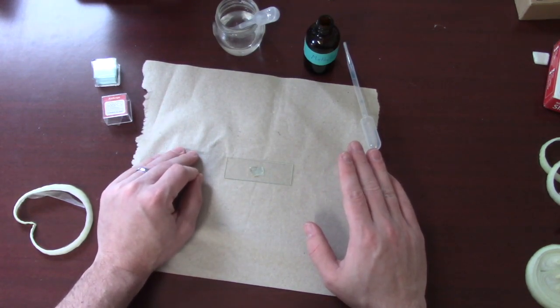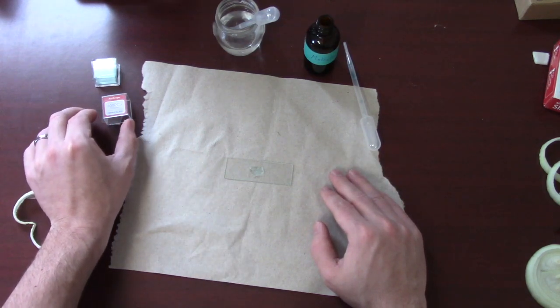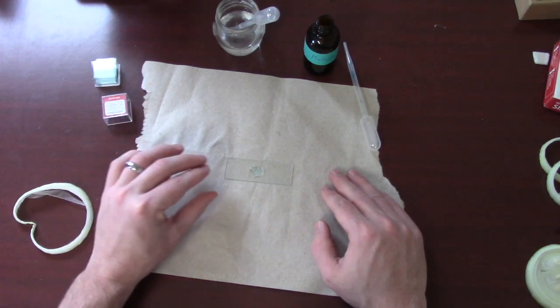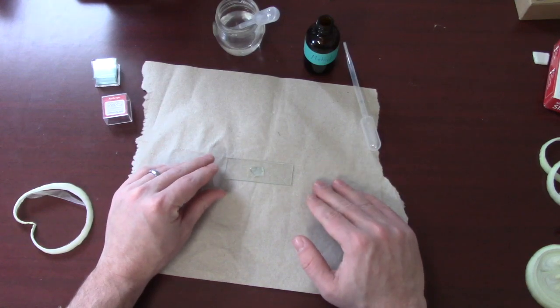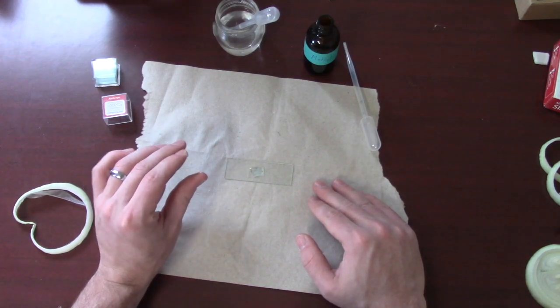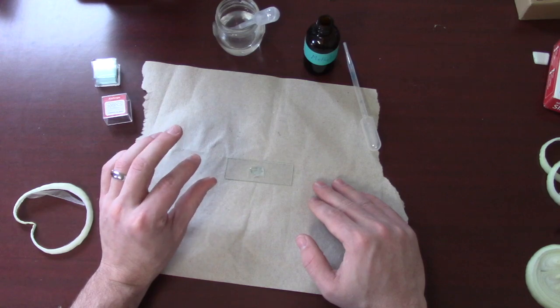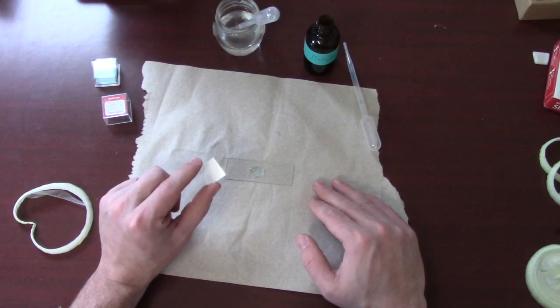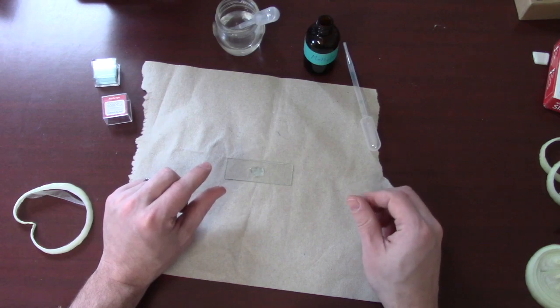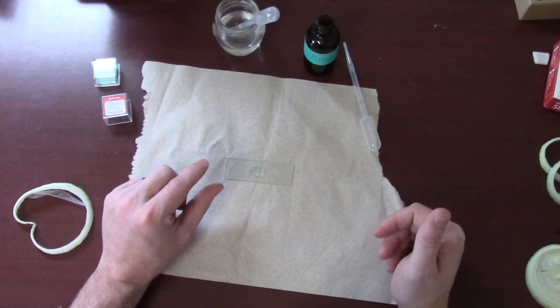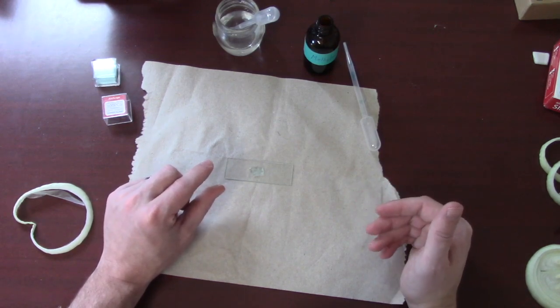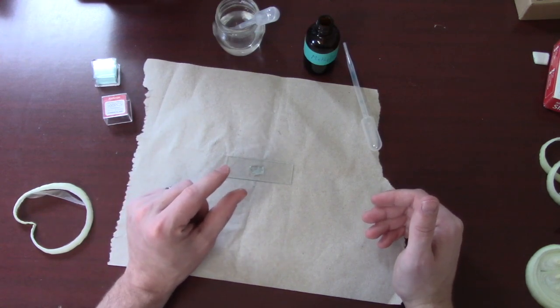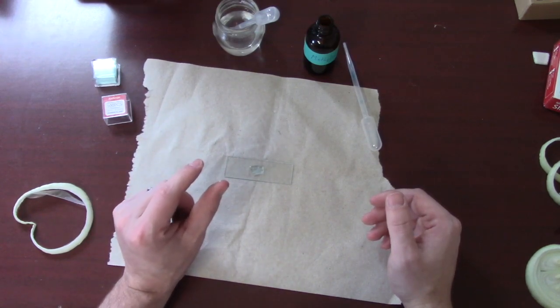Alright, that should be about ready. The next step is to add our cover slip. So, just like the microscope slide, we want to make sure our cover slip is nice and clean. And do you notice how I'm holding it by the edges? If you hold it by the top and bottom, you're going to get thumb prints on it. And the cover slip will end up dirty and it will be harder to see through. So, always hold microscope slides and cover slips by their edges.